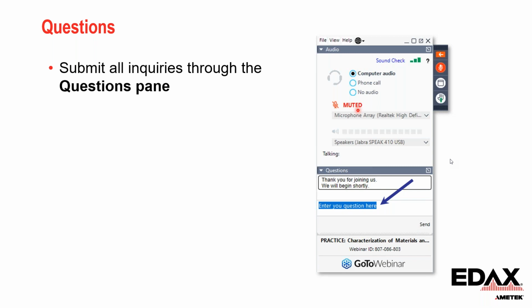This question is about lithium analysis. Is it possible to analyze lithium? The answer is no. Neither WDS nor EDS can analyze lithium. For the WDS, we do not have a diffractor to cover the energy range of lithium.